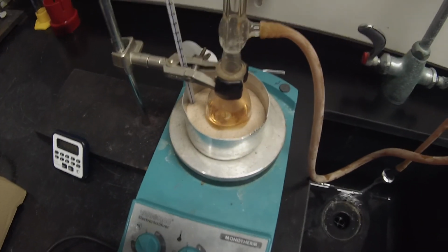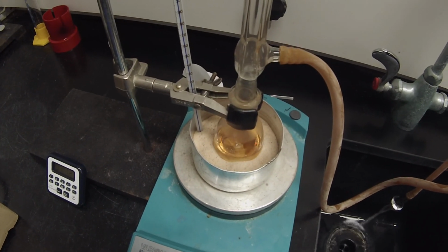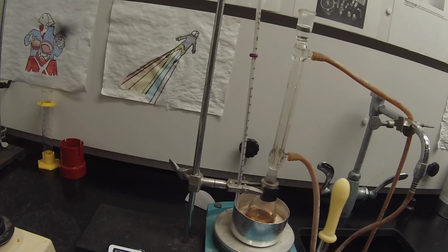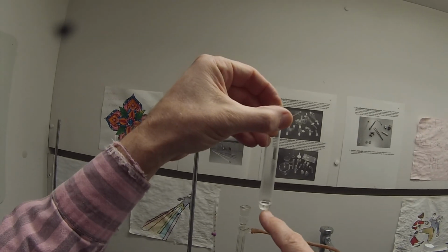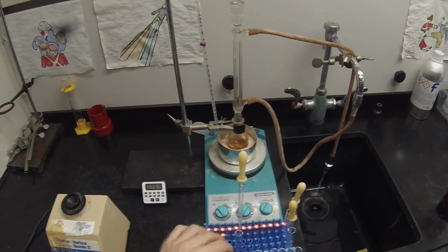You can see that that's turning more colored. Pink has gone to kind of a more orangey red. By the end of the reaction, it will have turned quite dark. Acid-catalyzed dehydrations usually do. Stable temperature, good flow rate. 2.5 minutes to the next data point. You can see that it's a little cloudy, so centrifugation will probably be useful. Mix those a little bit because I'm bored.